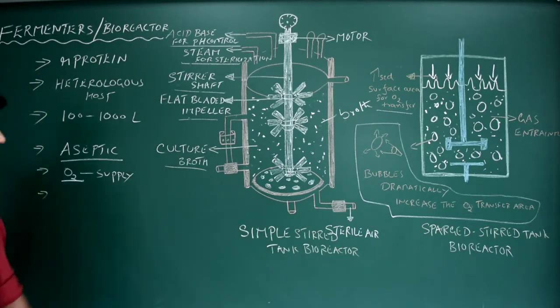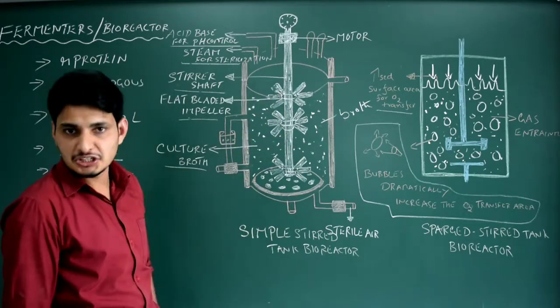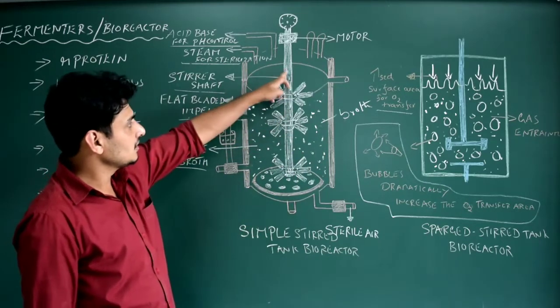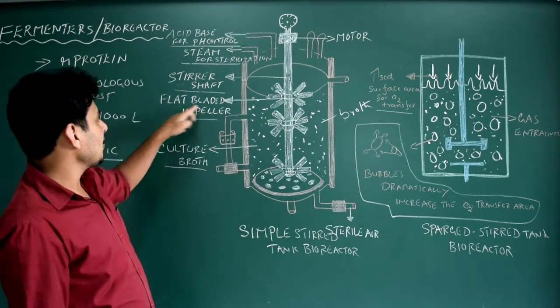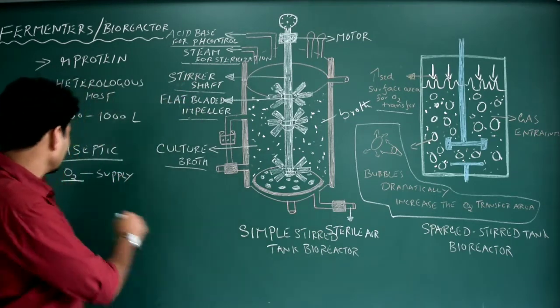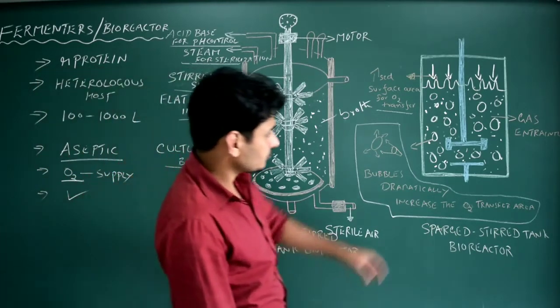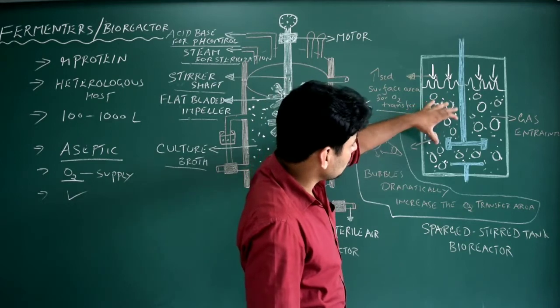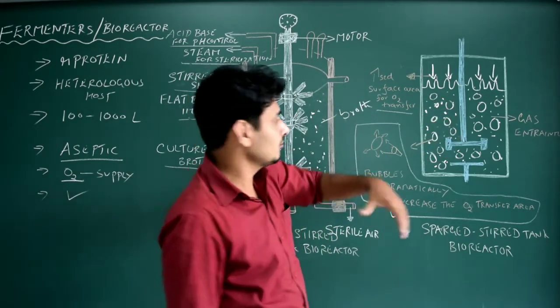Other than that, we need to mix this particular broth every day. Mixing, agitation is required. For this we need, as I said, a stirrer shaft which is attached with a flat bladed impeller. I think you can write on that. This is actually the important thing. And the other thing is we need to maintain the oxygen level. That is one more challenging thing.